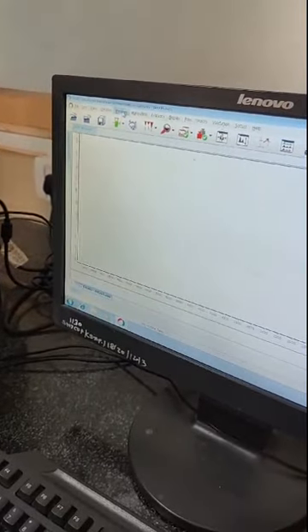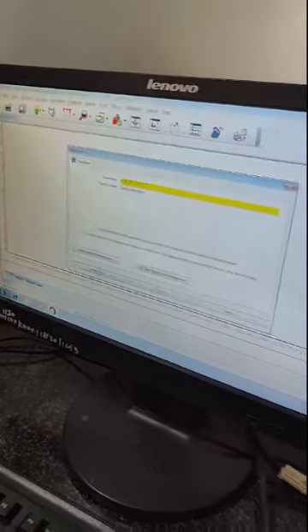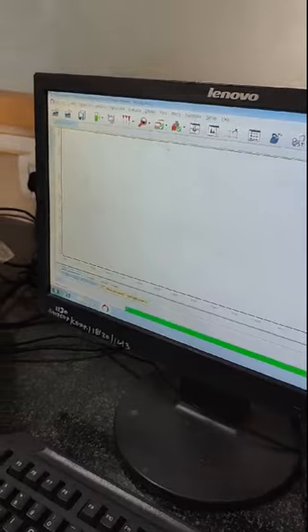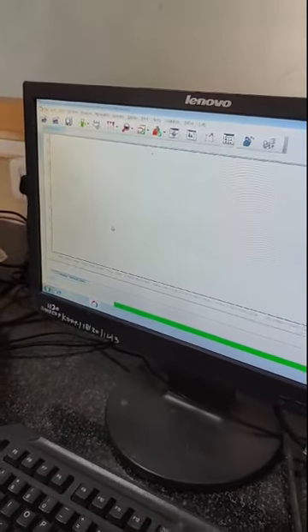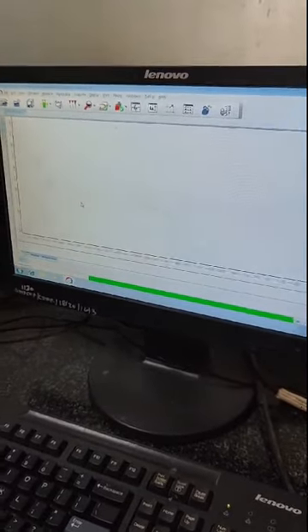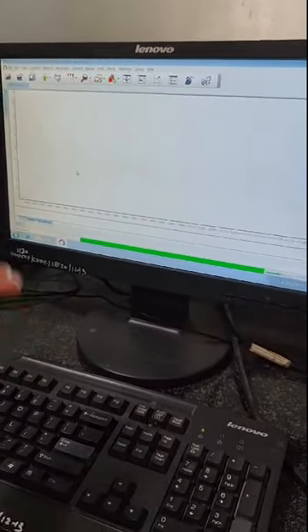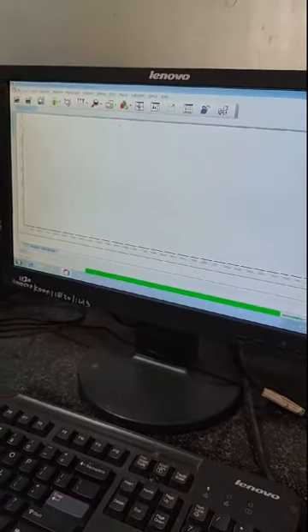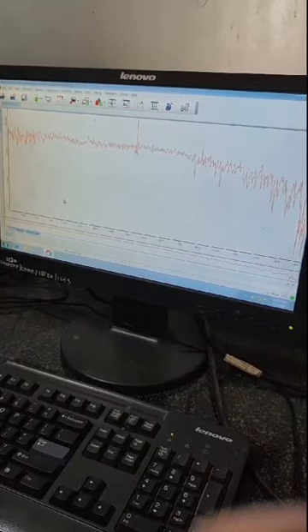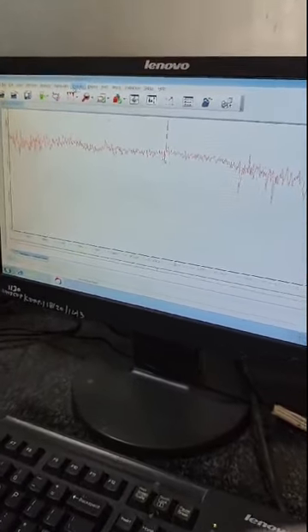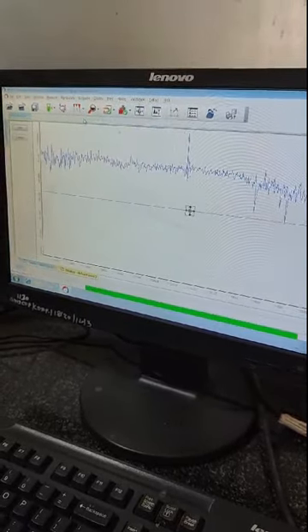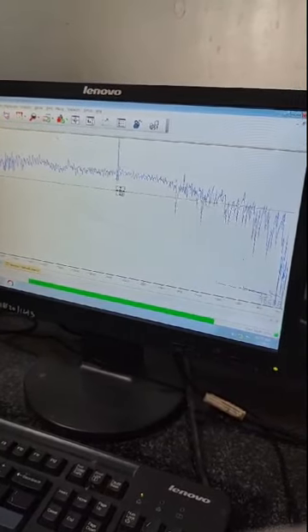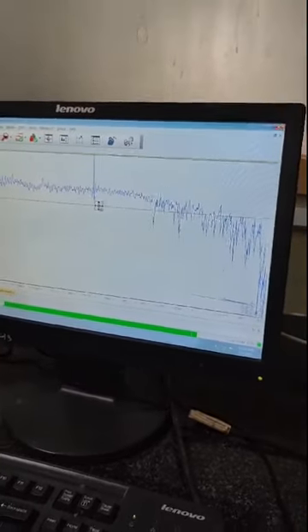We have now set the measurement to transmittance. We click 'Start Sample Measurement' and will get the peaks as transmittance with wave number. The sample scans are going on — just wait for a moment. Now we can see the graph displayed as transmittance. Using interactive peak picking, we can see the peaks.